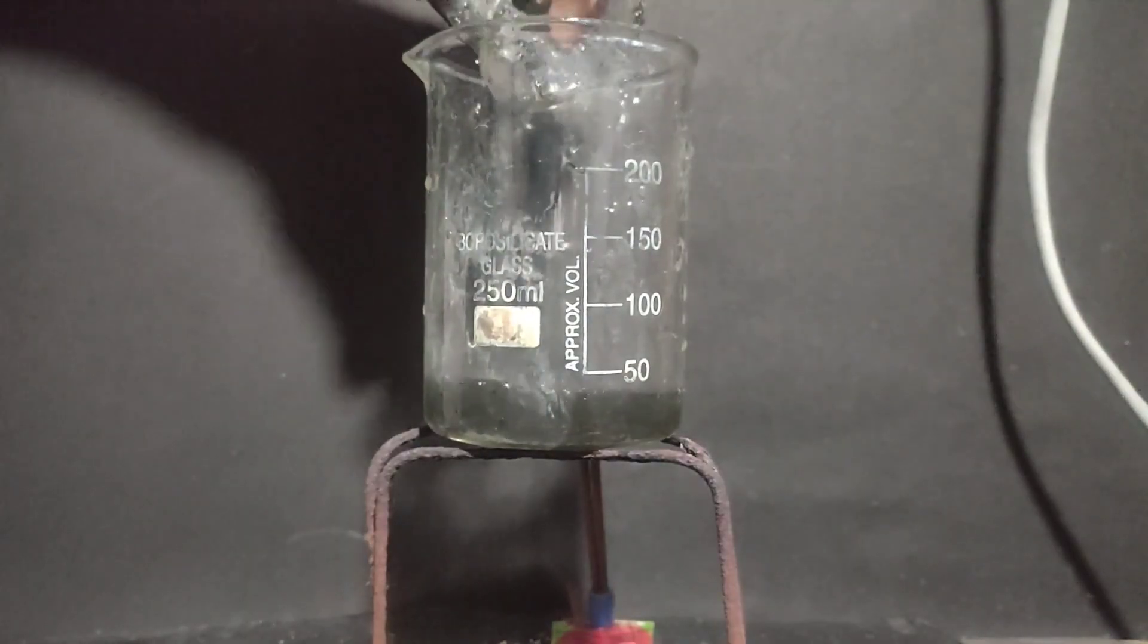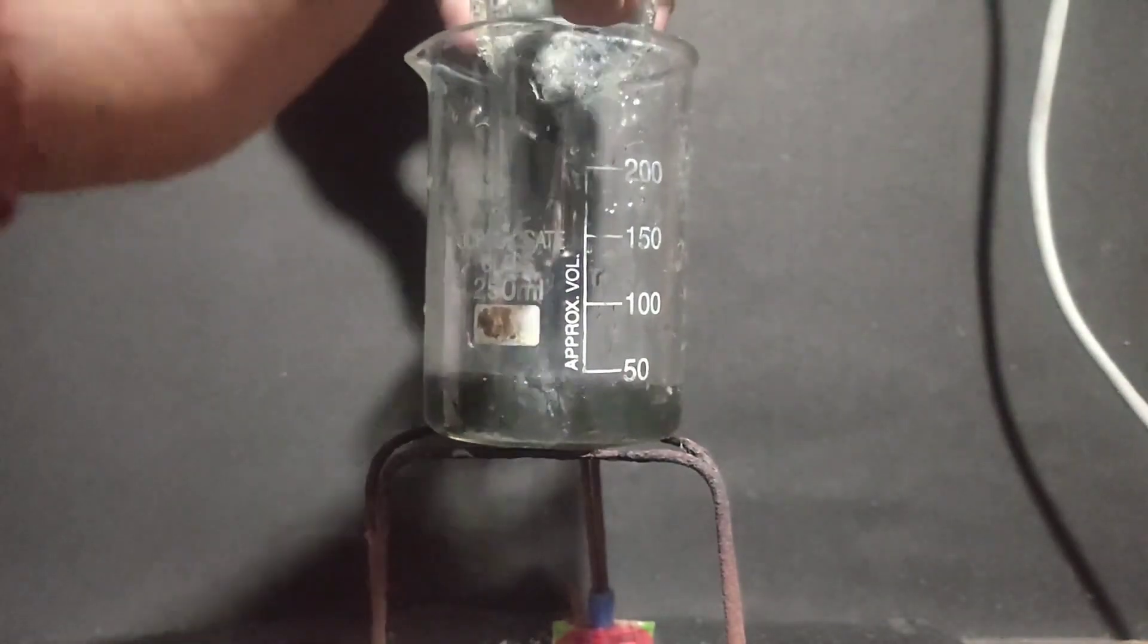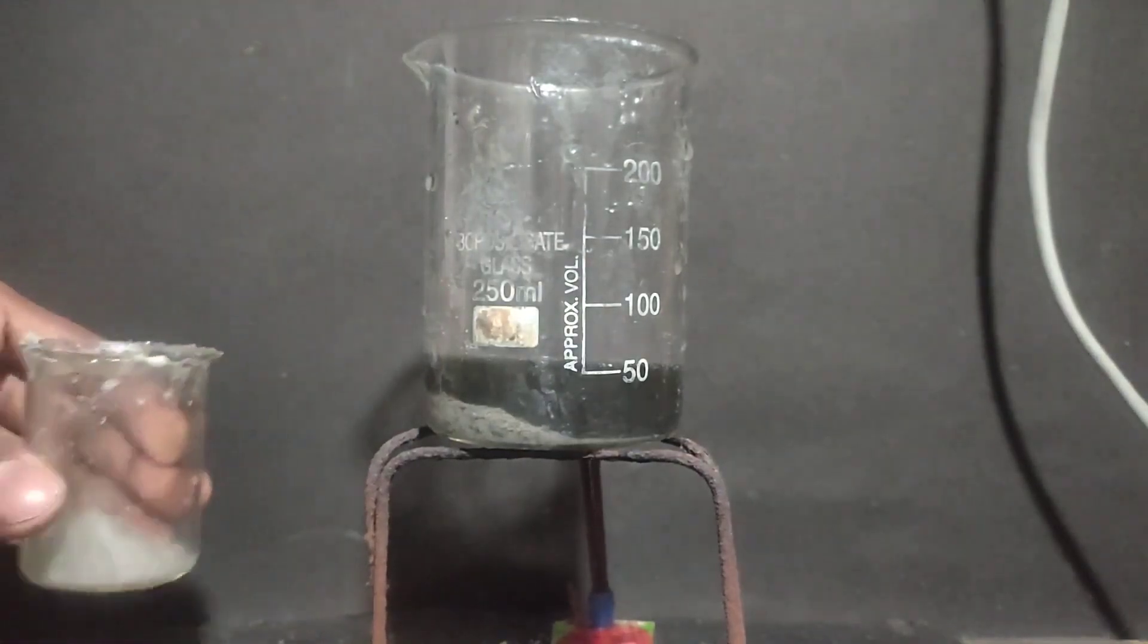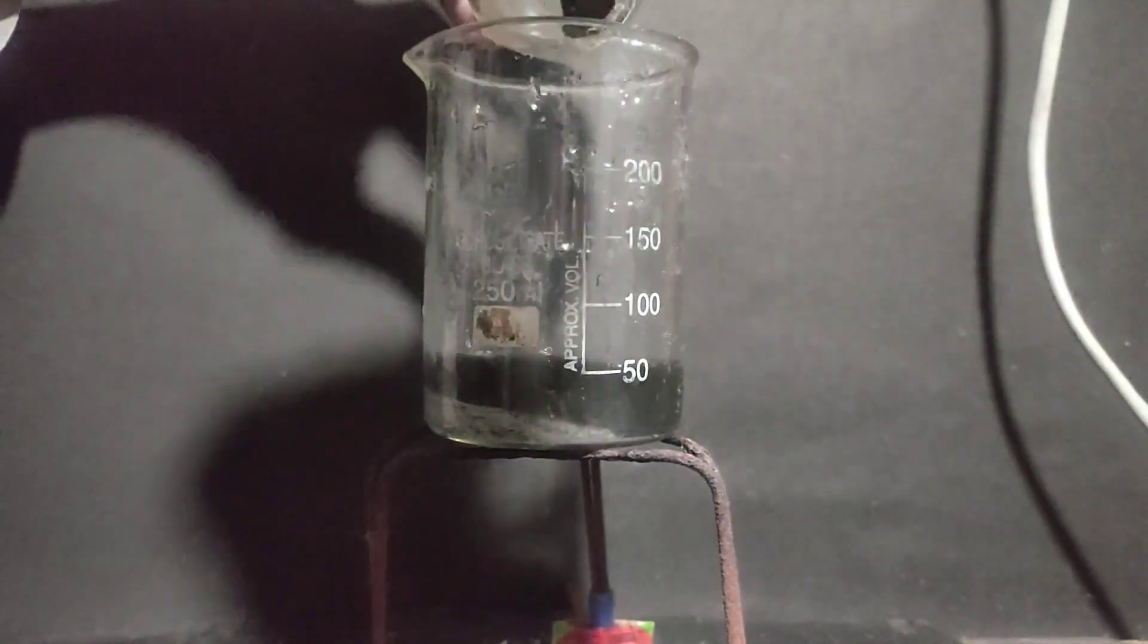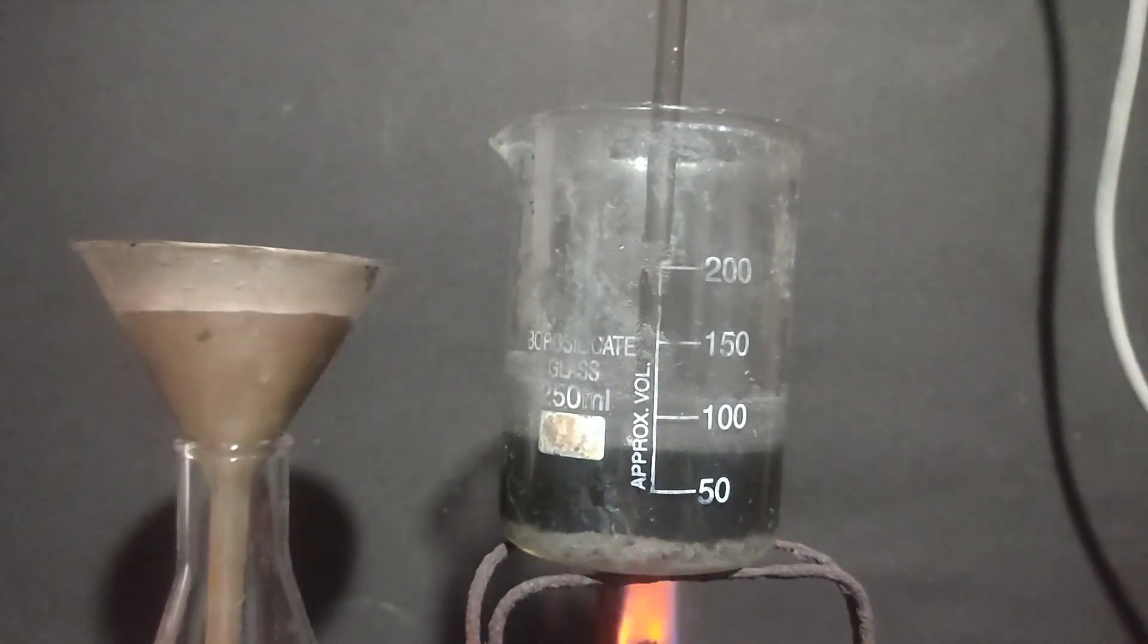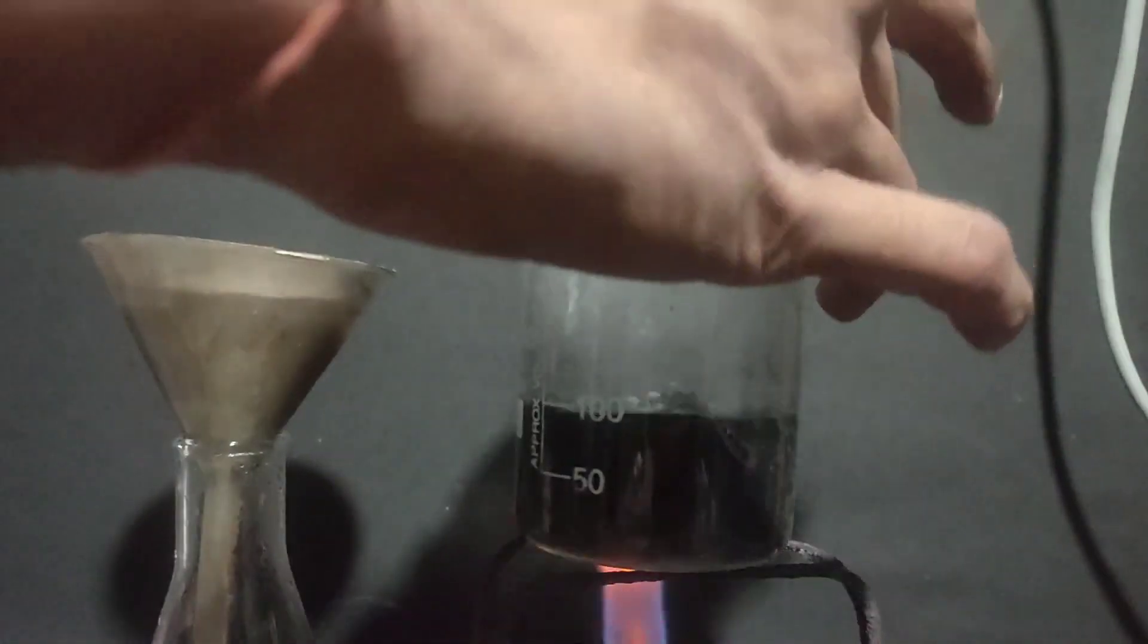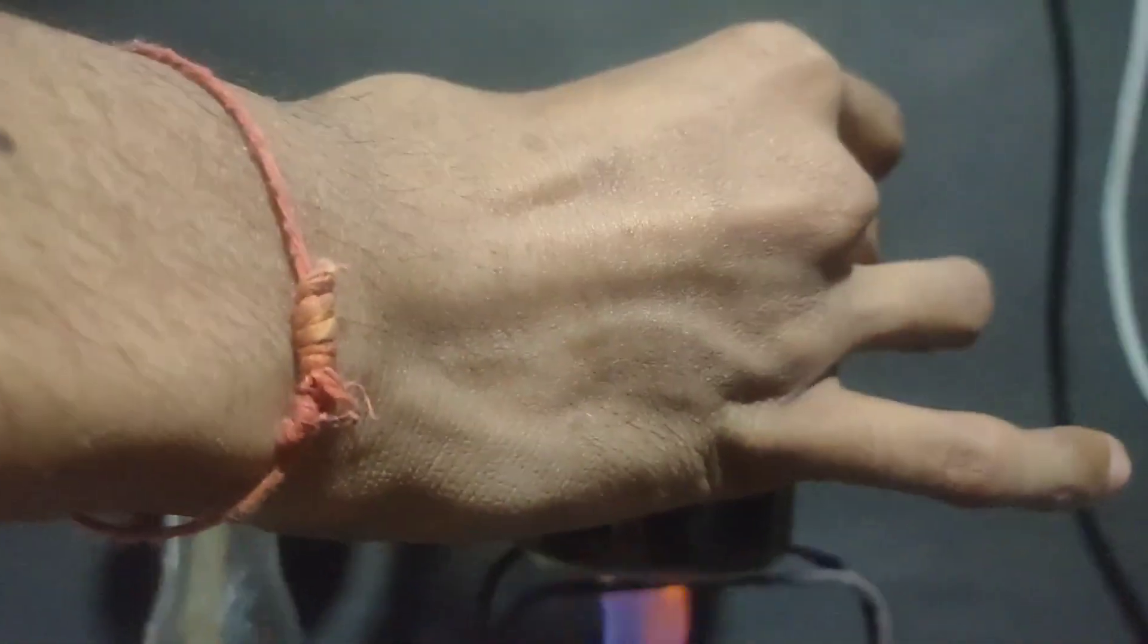So I transferred all the contents of the small beaker into a large 250 ml beaker and added enough water which could dissolve all this potassium bromate on heating the solution. Then I started heating the solution with stirring and I kept on adding water. I had to add around 100 ml of water and then I filtered the solution hot by gravity filtration.